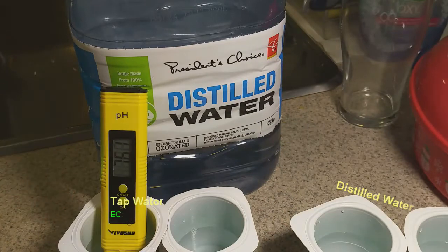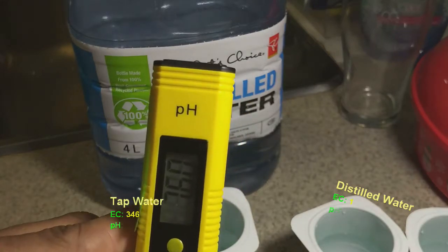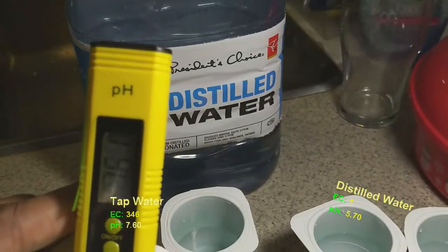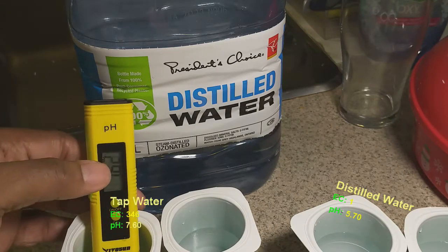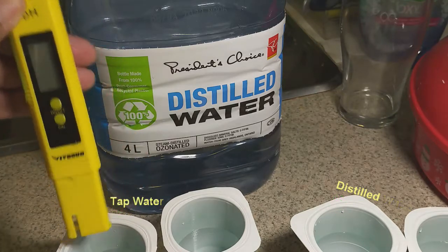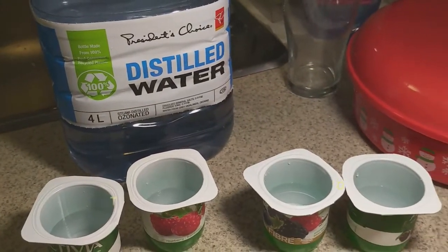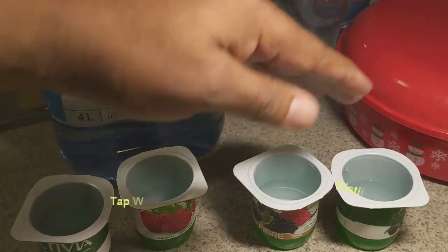And where do we end up for the tap water pH? Seven point sixty — 7.60 for that. That just goes to demonstrate the difference between distilled water and tap water when you're comparing the chemicals in tap water versus distilled water.